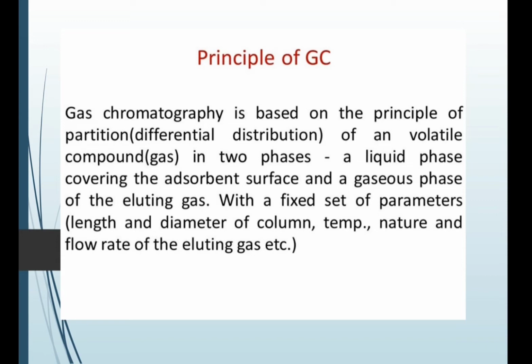And with a fixed set of parameters, we can do the analysis. The length and the diameter of the column, the temperature of the system will be maintained, and the nature and the flow rate of the eluting gas are important. So this is the principle of gas chromatography.